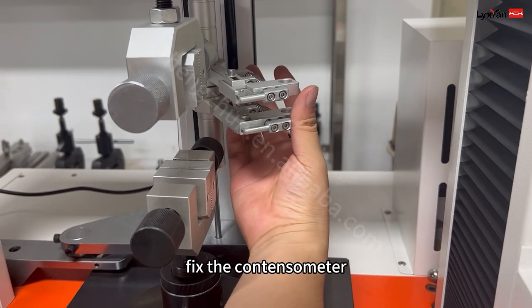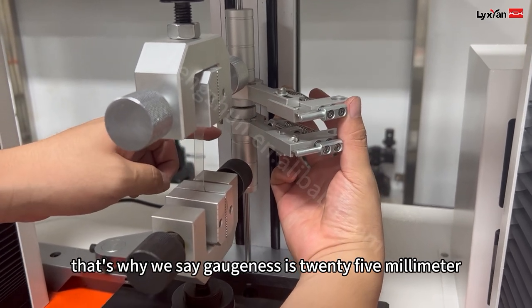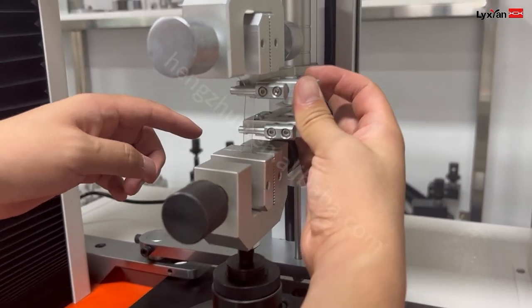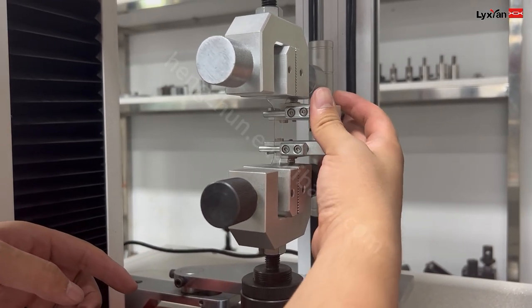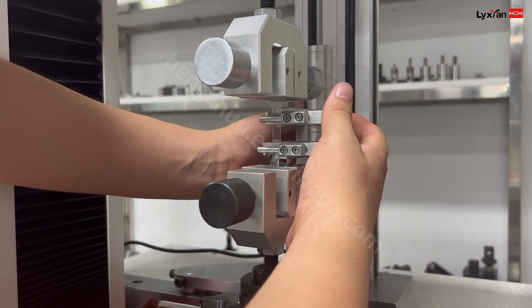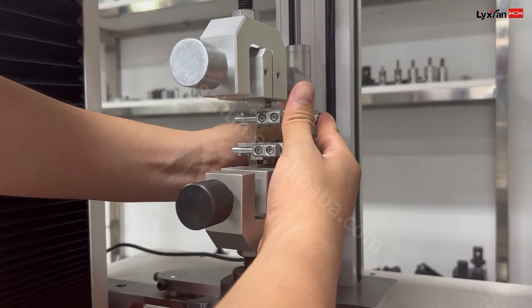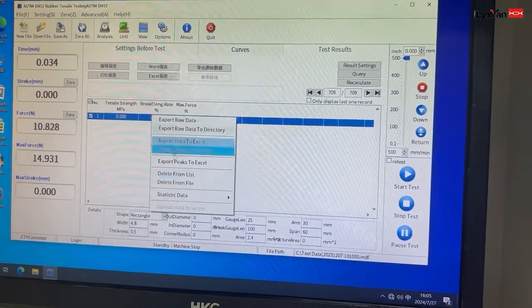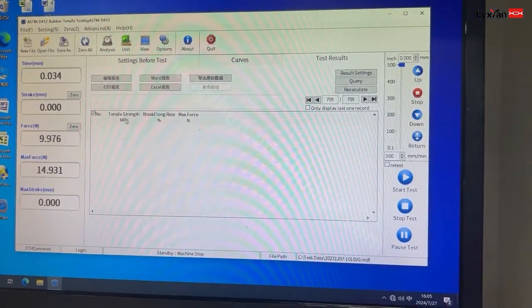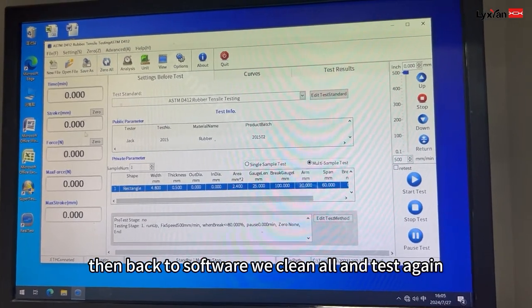Fix the distance. The distance is 25mm. That's why we say the gauge length is 25mm — it's a little bit. Now back to software, we are clearing all and testing again.